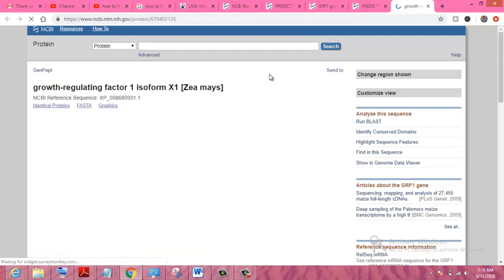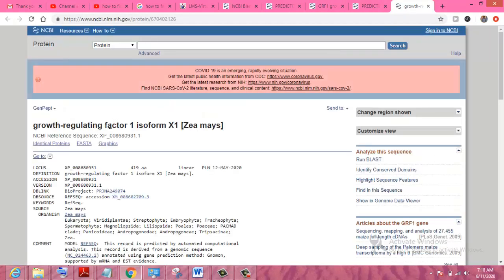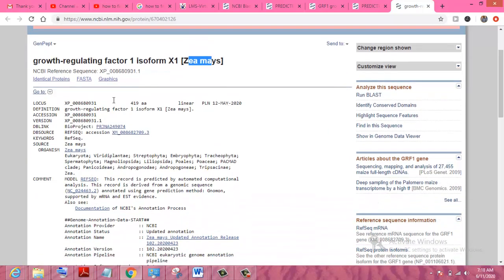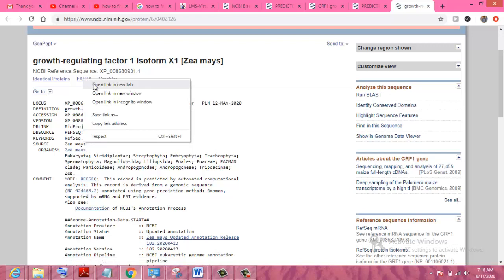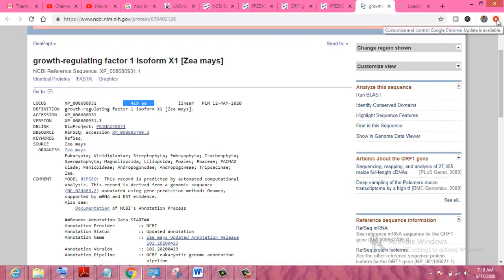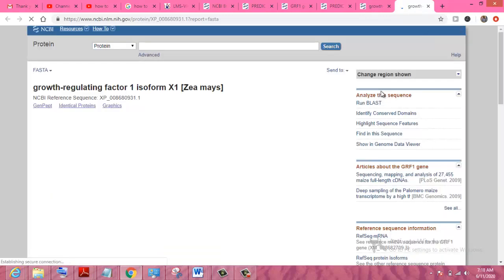Here you can see this is the growth regulatory factor isoform one in Zea mays. The total amino acid length of this protein is 419. You can click on FASTA format to view it. This is the sequence of the specific protein from the specific gene.